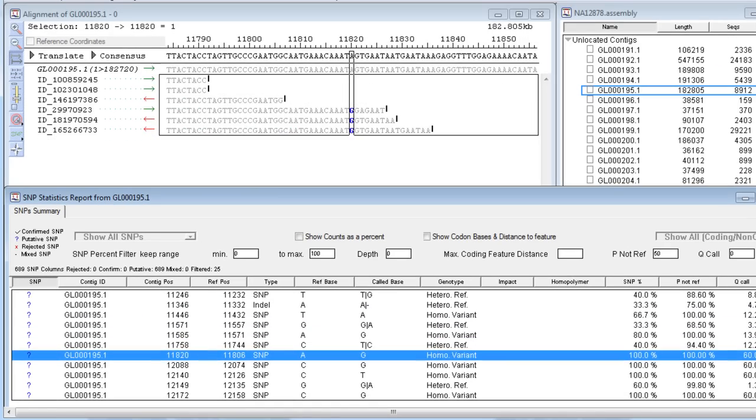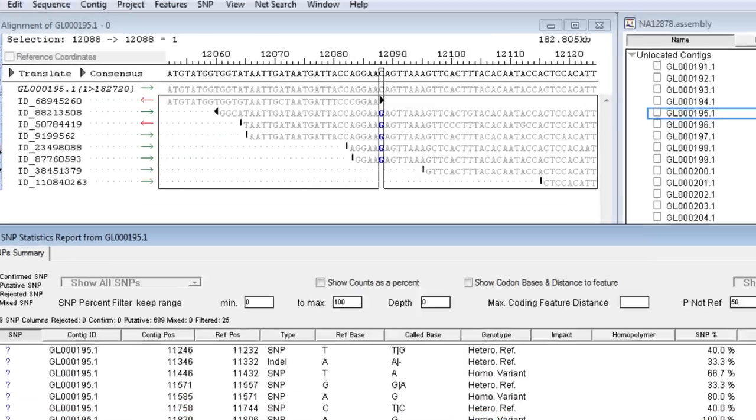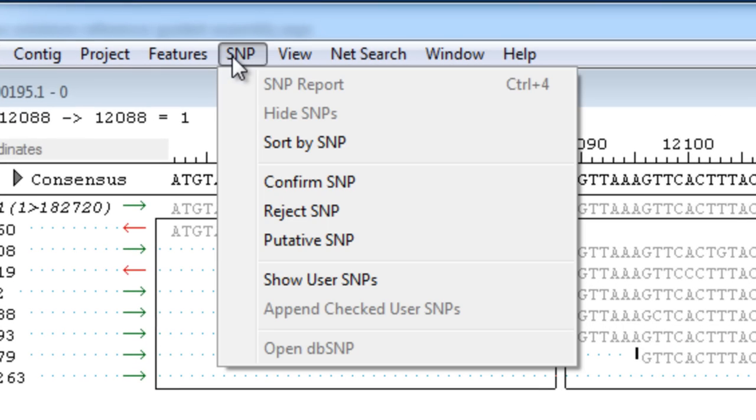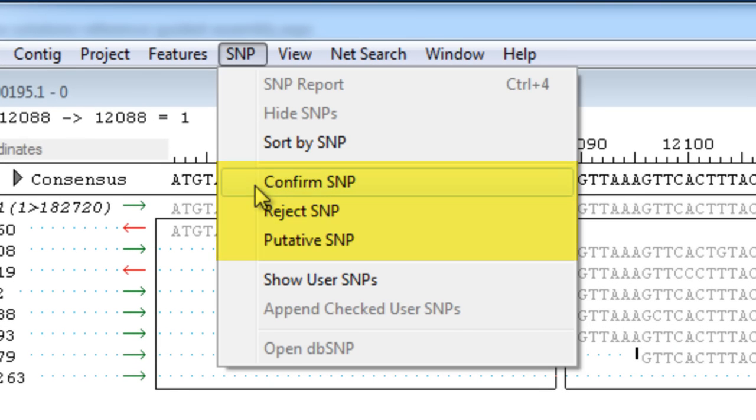As you navigate through the SNP report, view the SNP in the context of the alignment simultaneously. Mark SNPs as confirmed or rejected as you go.